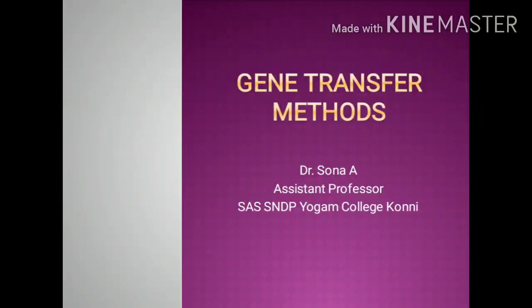In this video, we'll see very briefly about retroviral transduction, about macroinjection, and about liposome-mediated gene transfer.